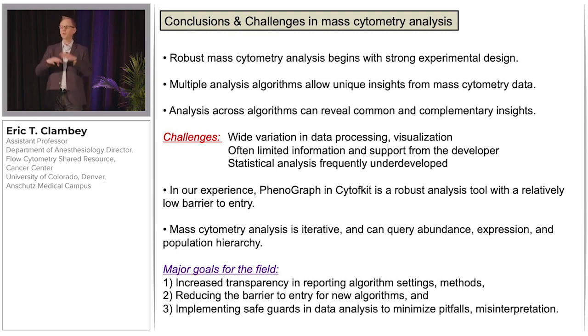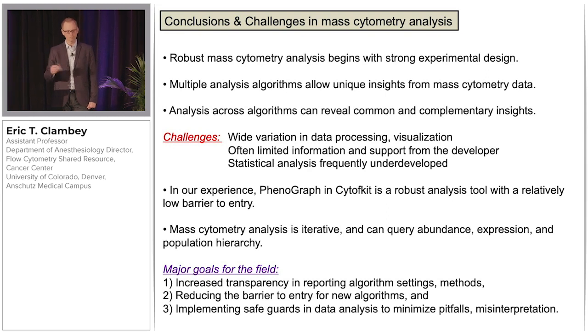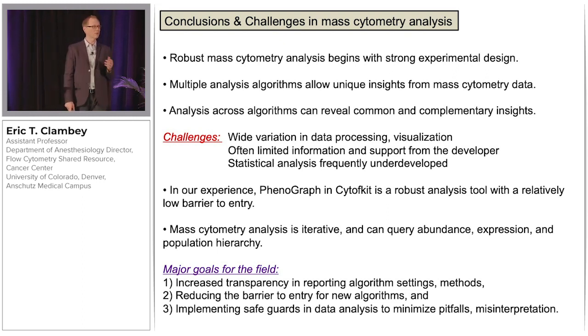Now, I will say, multiple algorithms will allow you to make similar conclusions, but nonetheless, it's a dizzying number of algorithms programmed into different languages, and navigating this can be extremely challenging. There are multiple ways that you can analyze these data, but please note that this is an iterative process where you can query abundance, expression, population hierarchies. And then finally, I'd suggest three major goals for the field. One, I'd suggest increased transparency in reporting your algorithm settings and your methods. Two, I'd recommend reducing the barrier to entry for algorithms.